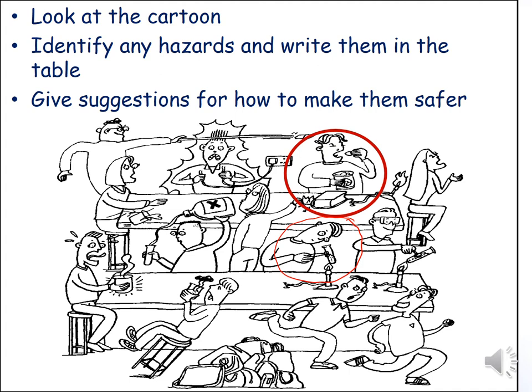The hazard here is that this student is not wearing goggles. Whenever you are carrying out a science practical, you must always wear goggles. In fact, I can only see one student, this student here next to him, that is wearing goggles.